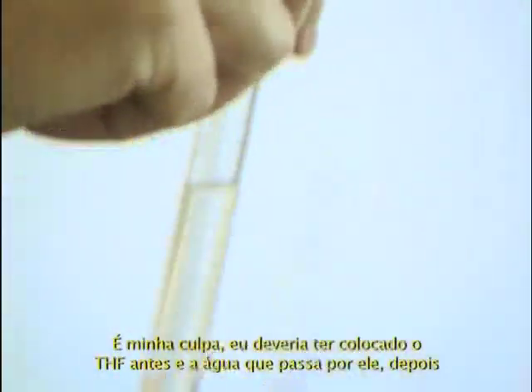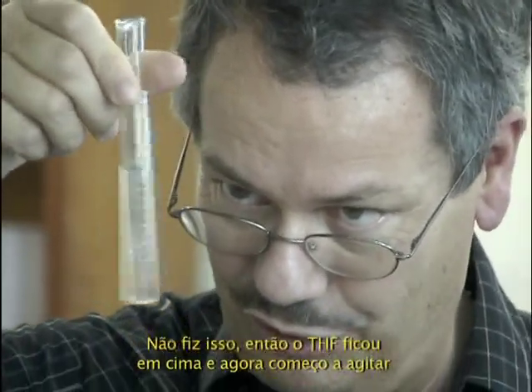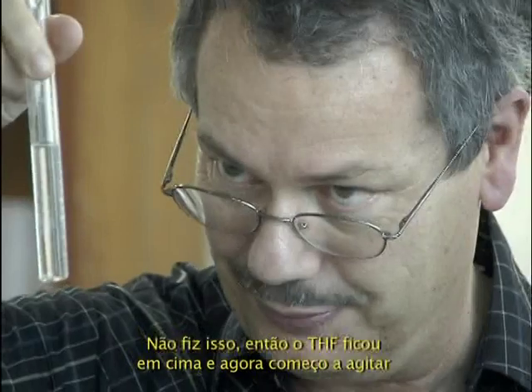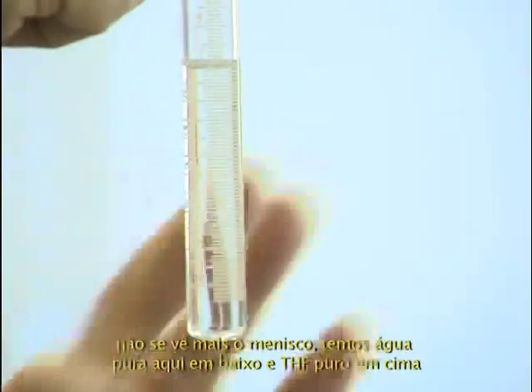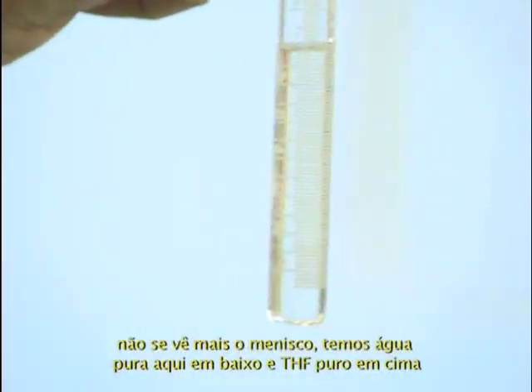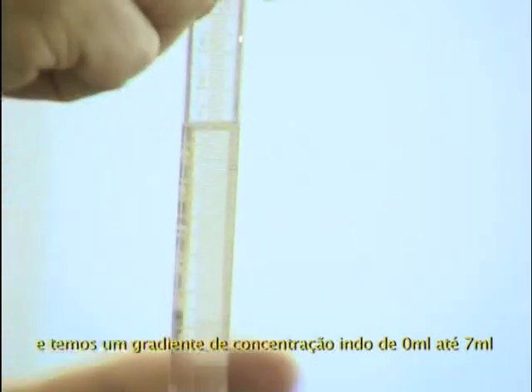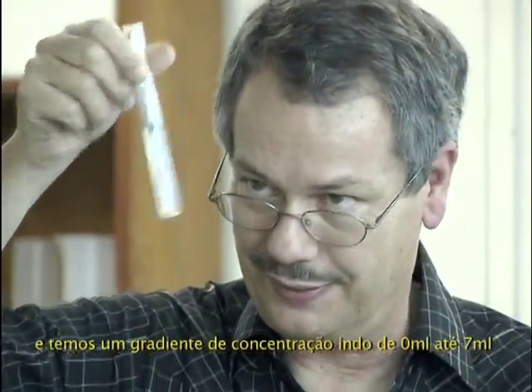I should put THF first and the water second. I did not. So THF just went up through the water. And now I start to shake. You don't see any more meniscus, but you have pure water at the bottom, pure THF at the top, and a gradient of concentration going from 0 mL to 7 mL here.